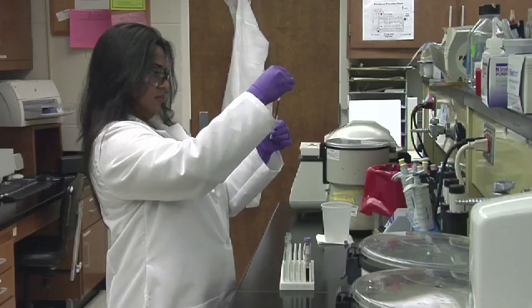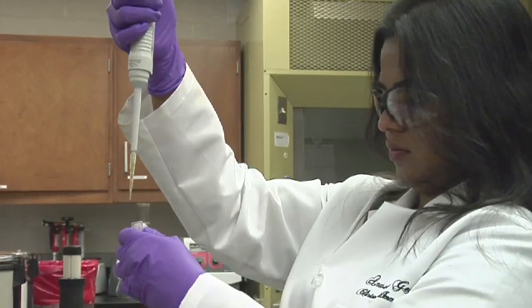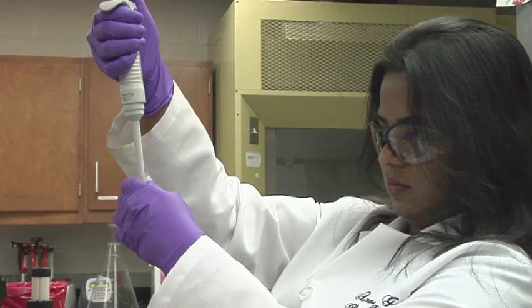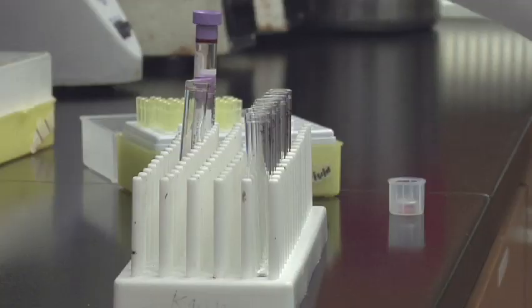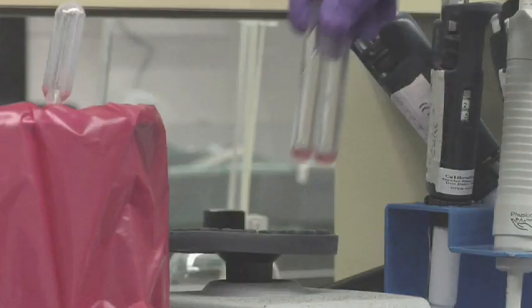The lab's RBC antibody test confirms cases of immune-mediated disorders in dogs and horses that have presented with low red blood cell counts. Blood samples for this test must be received within 24 hours for proper testing.